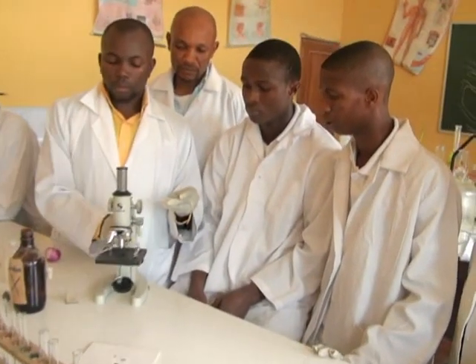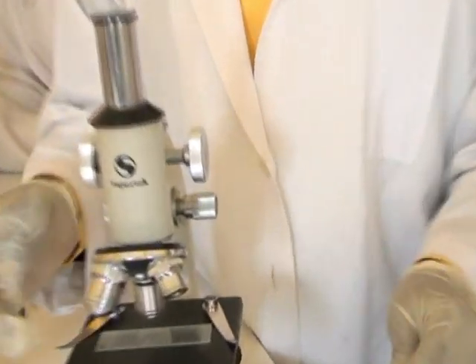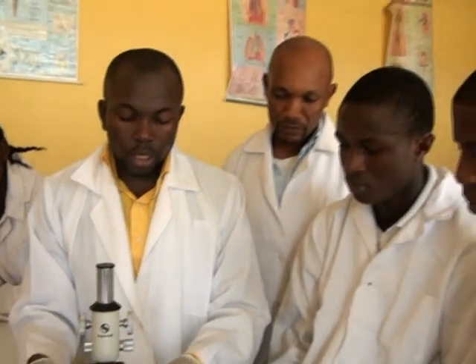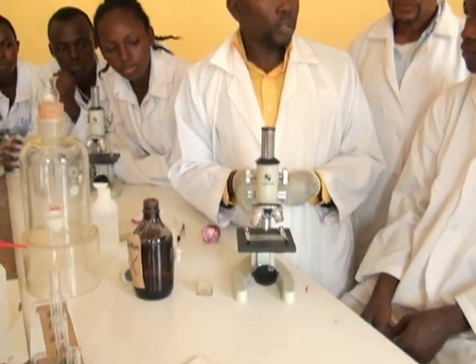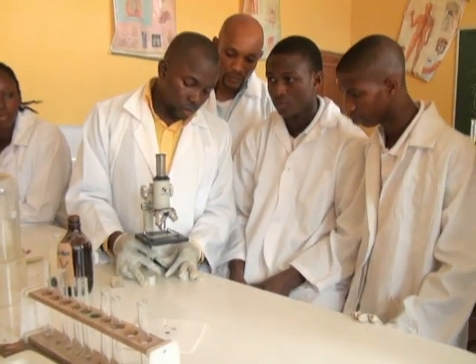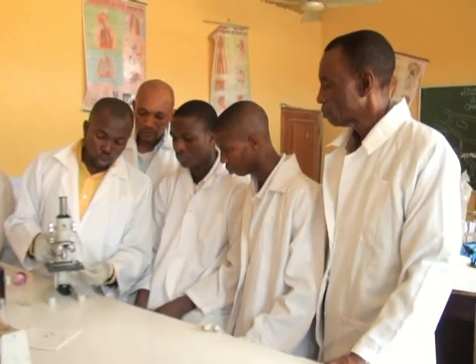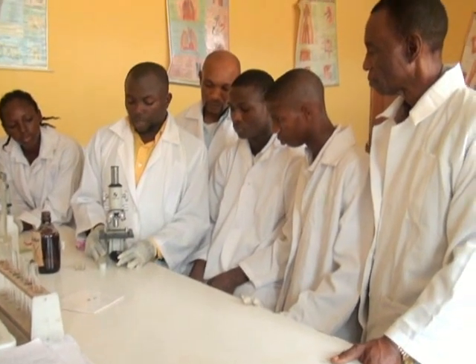This is a clip on the stage of the microscope. You place the slide on the microscope stage and allow the specimen to stay over the hole of this stage. Then you hold it with the what? Clip. Hold the slide with the clip, so that it will be steady. Then you adjust the mirror. You can see the mirror here. You adjust this mirror to reflect light on the specimen. Then you open the iris diaphragm to get more light on the specimen.